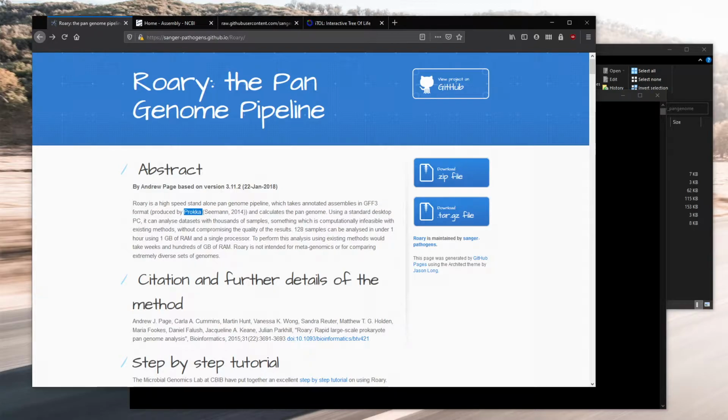The core genome is basically all of the genes that make that particular species that species. If we go back to the E. coli example, what are all of the genes that are common in all of the E. coli, so that we can say this is what makes E. coli E. coli? On top of that, the pan-genome includes all of the genes that are in all of the E. coli, for example. If we had 100 E. coli genomes that were annotated, we could find maybe a really narrow number of genes that are common in all of the E. coli.